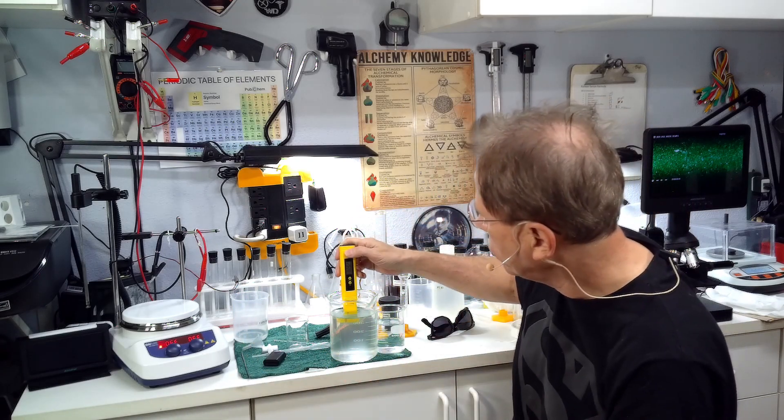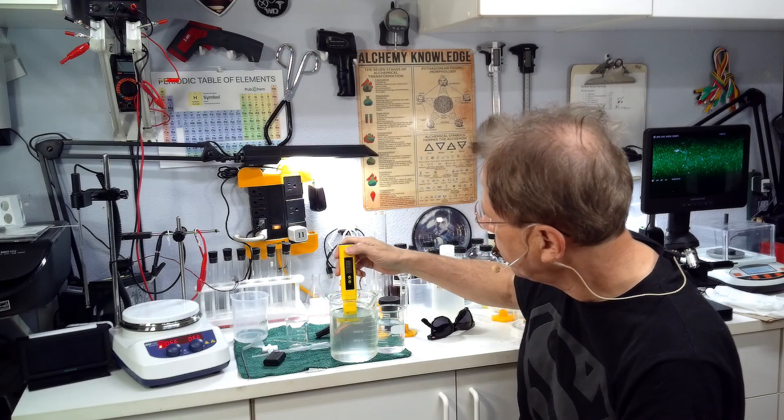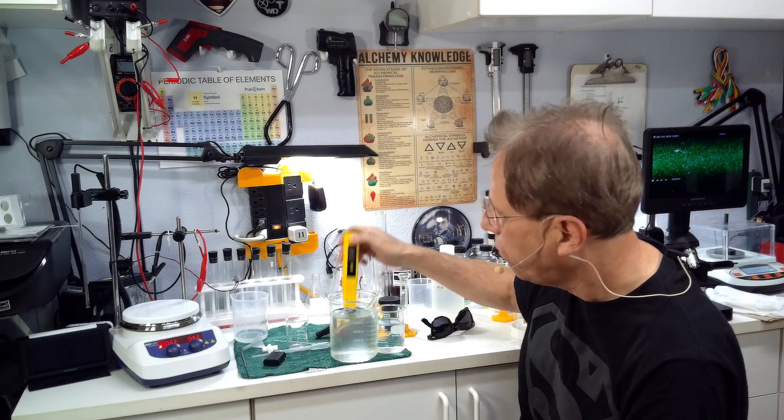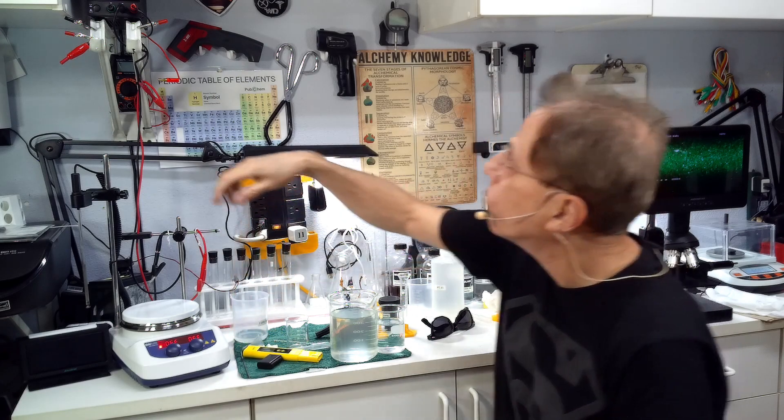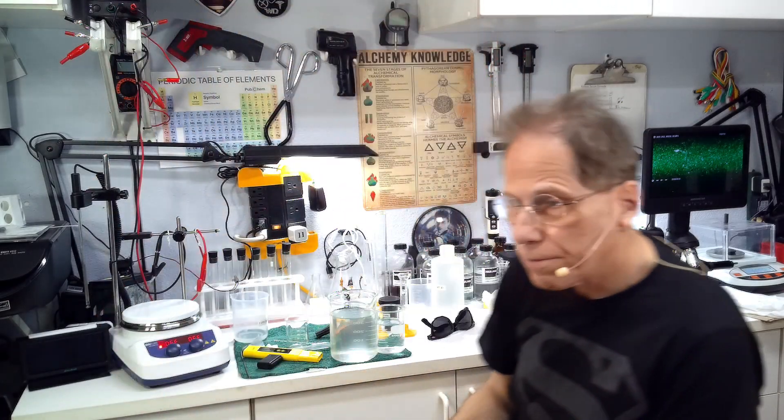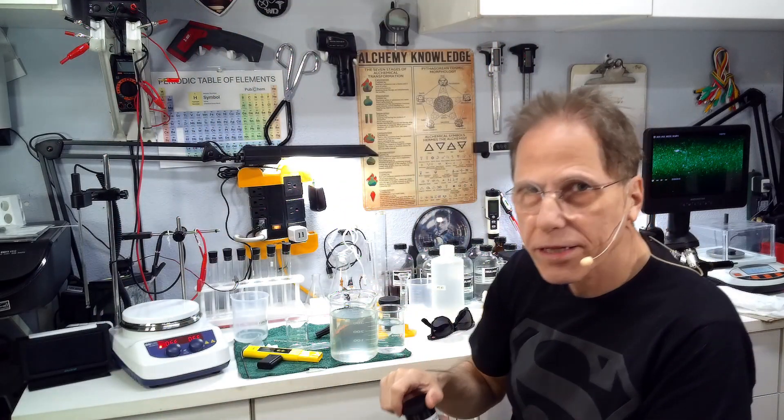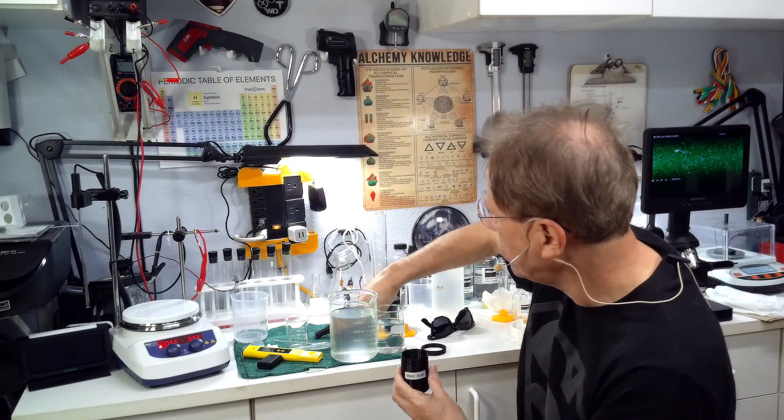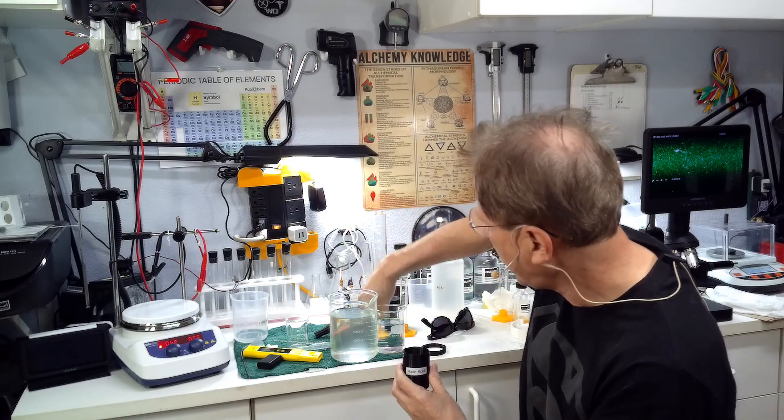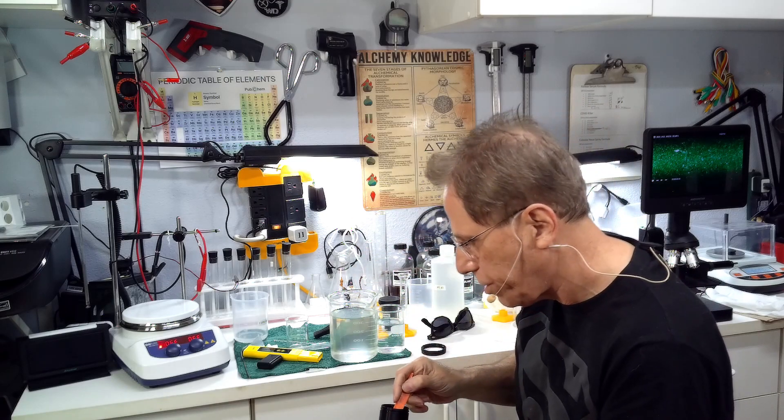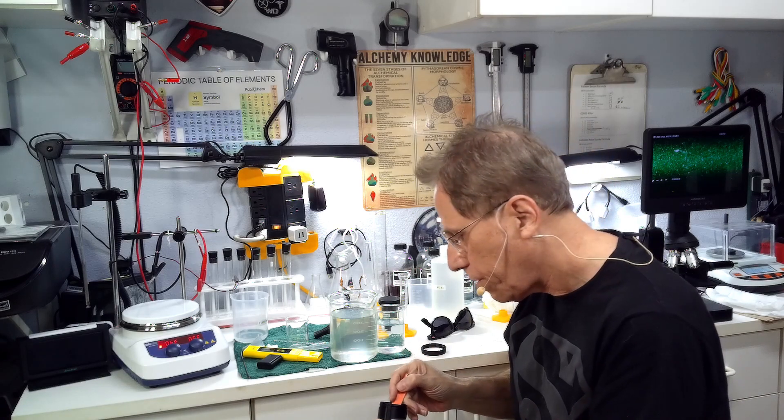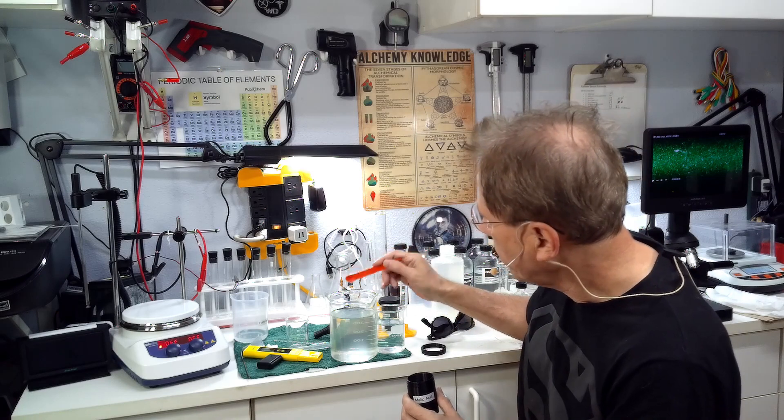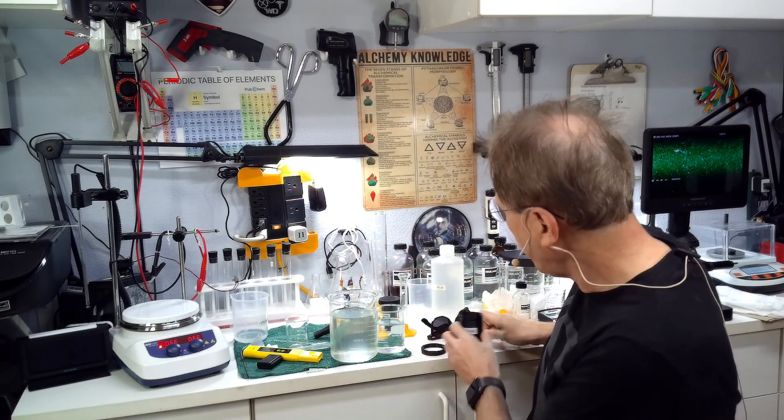We're going to take our pH meter, stick it in the solution here, measure the pH, and we got a pH of 8.4, which isn't bad. 8.4 is drinkable but let's bring it down to seven. I'm going to use malic acid. I am going to use a very tiny amount of malic acid because this is very strong. You can use citric acid too or even lemon juice.